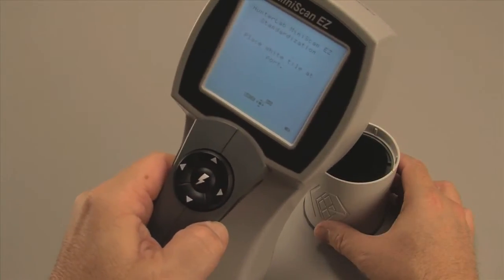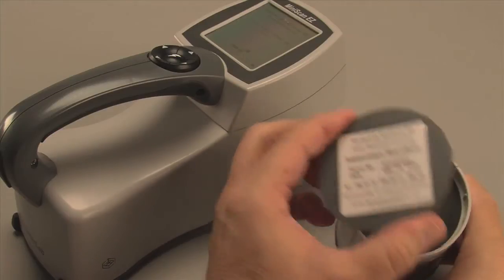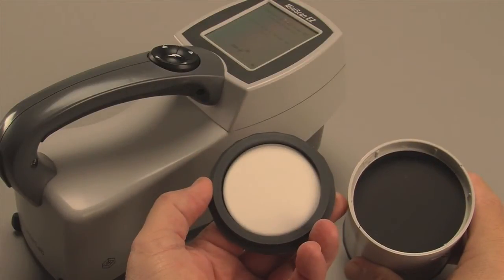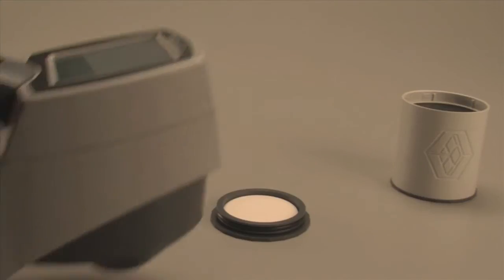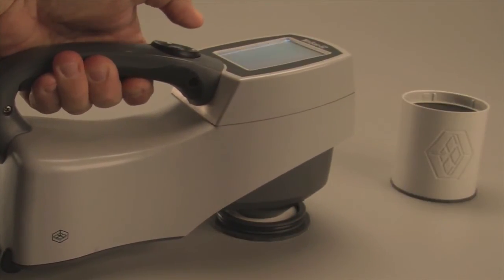The next prompt will ask you to place the white tile at the port. This tile is located in the calibration cylinder's end cap. Again, ensure that the tile is placed flat against the nose cone. Press the center Go button.